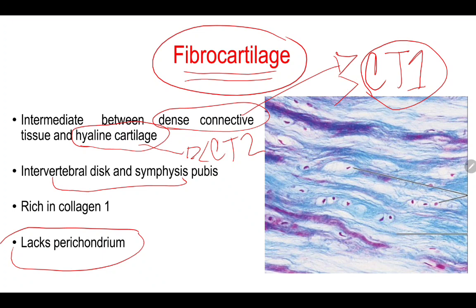So let's take a look. Since the fibers are visible, it is because of the collagen type 1. Meron ka rin makitang chondrocytes, diba, that are representative of a cartilage. Tama? So, fibers, cartilage, that's why fibrocartilage ang tawag. Since your fibrocartilage is rich in collagen type 1 and collagen type 1 is the strongest type of collagen fiber, therefore, you can conclude that fibrocartilage is the strongest cartilage.